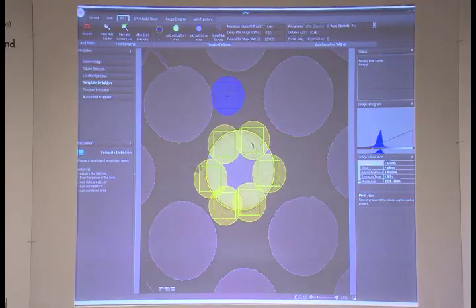And then the microscope will just go away and collect on all the holes that we've selected before based on the ice quality, and it will take 6 images in each of those holes, and that's how we collect. So we don't anymore need to go to each hole and manually expose each time. The machine will do that for us now.